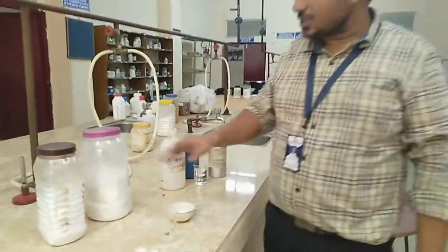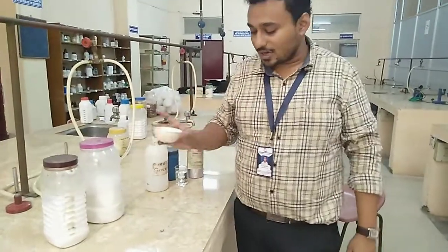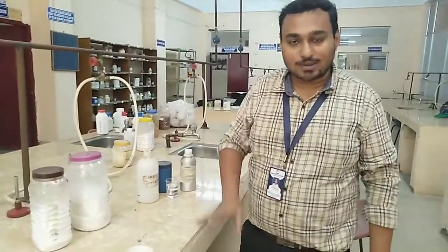For the preparation of the vanishing cream, we require a porcelain dish — this is the porcelain dish — and we need a water bath also.